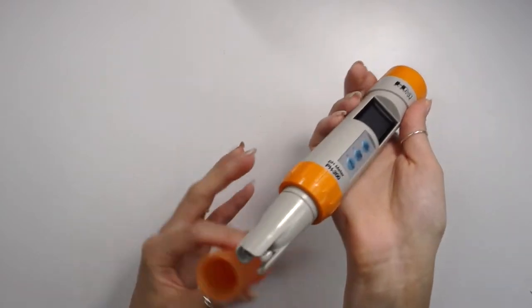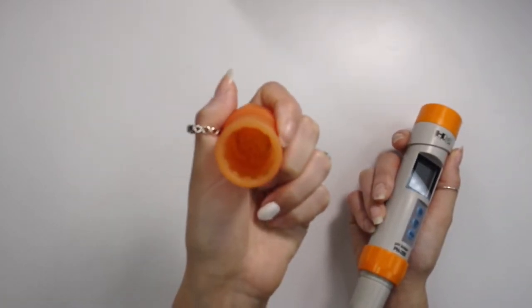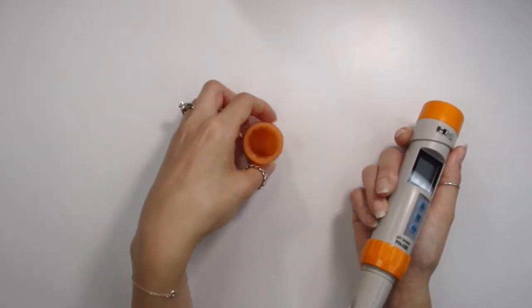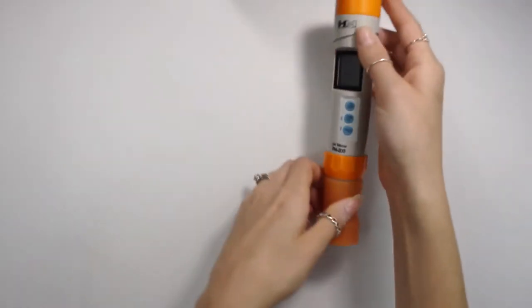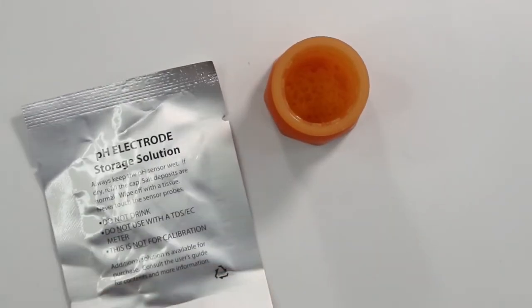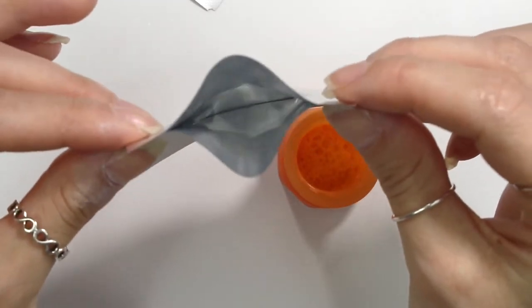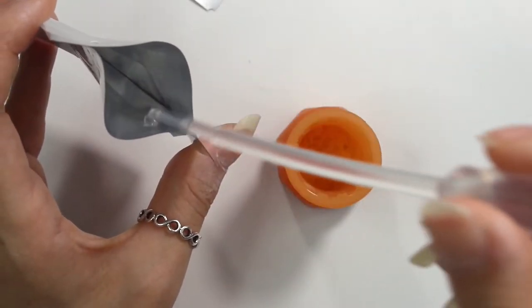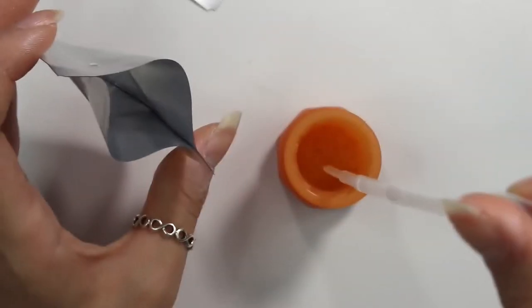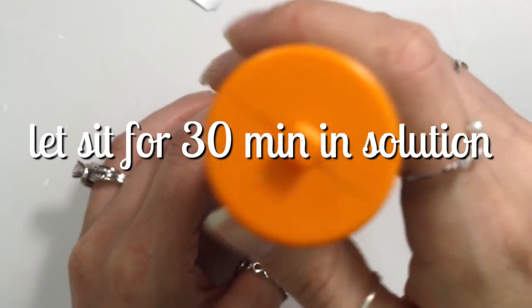So this is what the electrode looks like. You want to make sure you're not touching the electrode with your fingers or any kind of cloth. The cap has a sponge on the inside that you're supposed to saturate with the storage solution to keep the pH meter moist. When storing your pH meter, store it upright — I actually laid it flat at first because I hadn't read the user manual yet. The first thing the manual says is to pre-soak your pH meter for a half hour in the pH electrode storage solution. I used a pipette to pour the storage solution into the cap to make sure I didn't spill any, filled up the entire cap, and then recapped the pH meter and let it sit for a half hour.